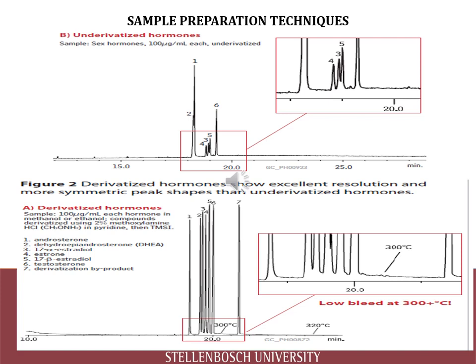Now one can see the benefit of derivatizing these compounds with TMS and methoxyamine, and obviously it makes sense that you will get very good sensitivity because of that.